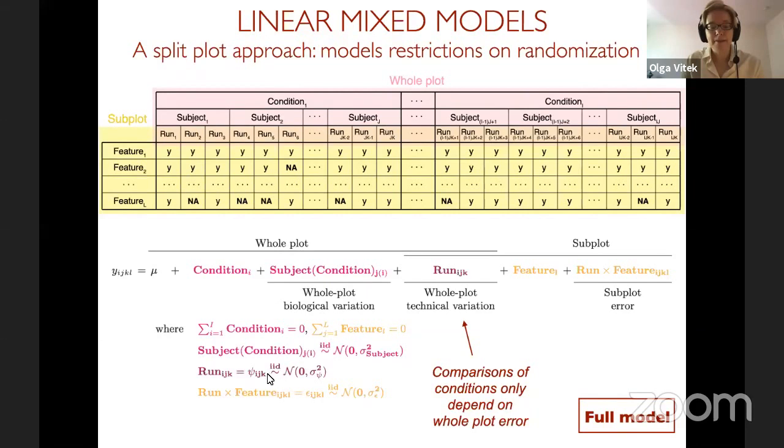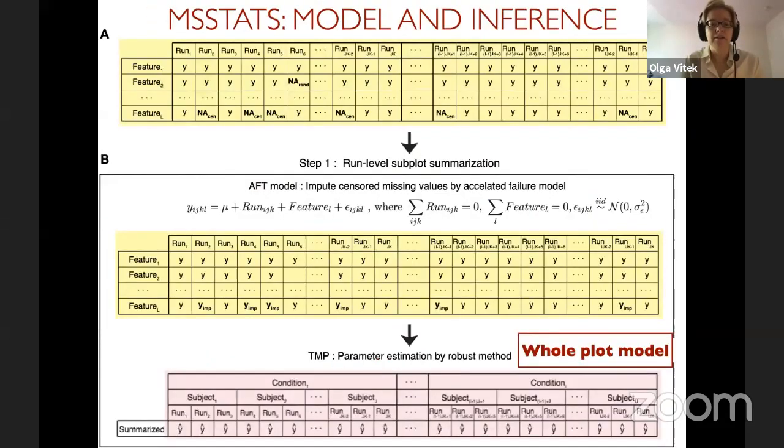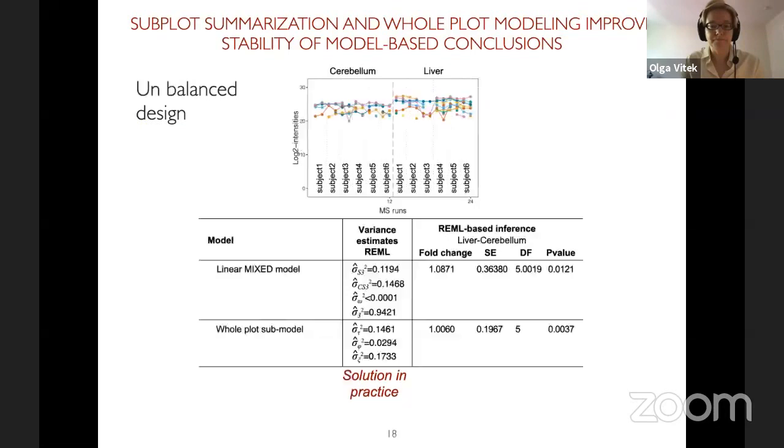And this is something which is really important. And so I would say that violations of dependence are much more problematic than violations of normality. And so a lot of work is done on one hand by experimental design to make sure that we can assume that there are no batch effects or contaminations and so on that violate independence. And on the other hand, represent the systematic patterns in the data to enough satisfaction that what is left over, the unexplained variation, can be viewed as independent and non-systematic.